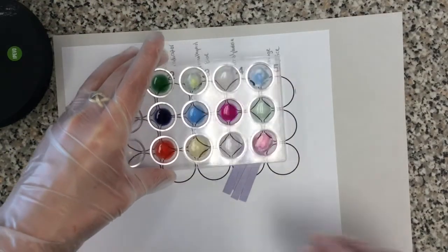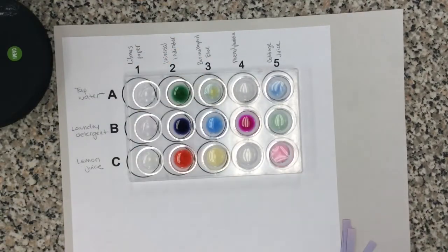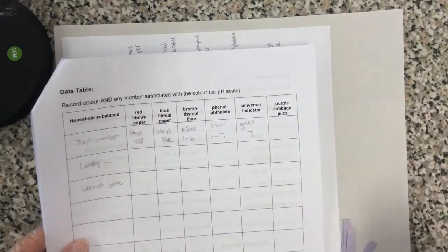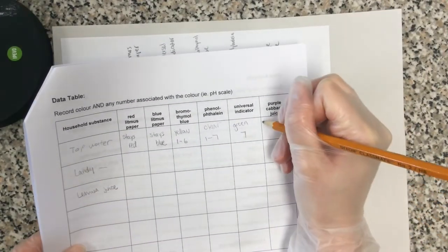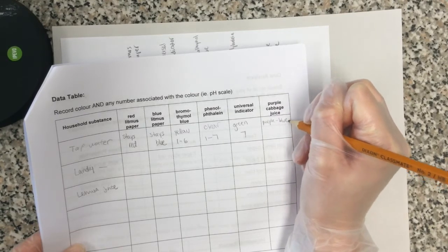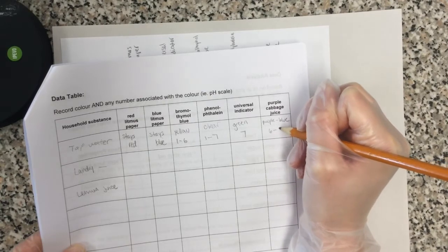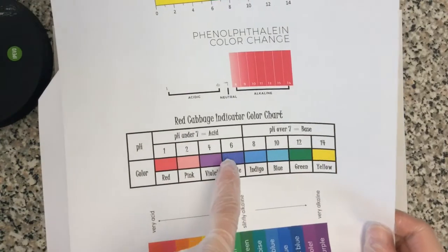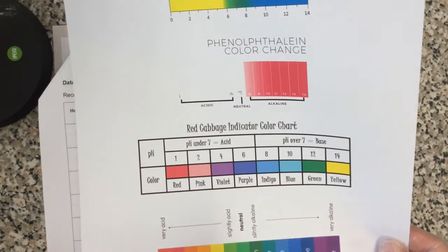Okay, but right now we are going to fill in just the tap water. Okay, so I observed it was kind of purple to blue, so its pH is between 6 to 8. Okay. Somewhere between purple to indigo, sorry, I should correct that.